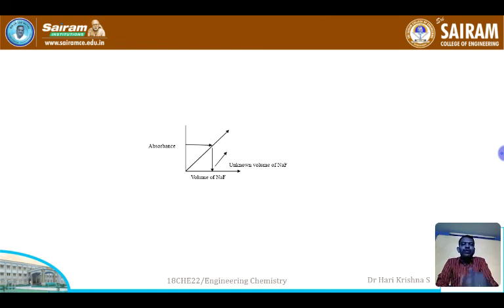So this is how fluoride concentration is determined using the colorimetric method. This is the classical method. But now, with the development of ion selective electrodes, as soon as we dip this pen-like electrode in a water sample, immediately it gives the concentration of fluoride, it gives the concentration of calcium, it gives the concentration of magnesium. This is the major contribution of the invention of ion selective electrodes. Recently we have a separate electrode for fluoride.